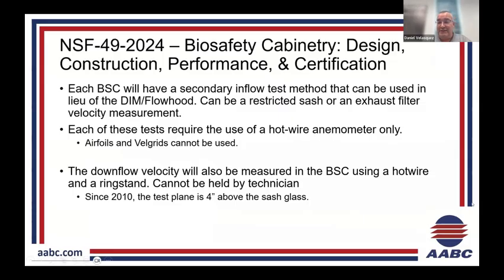Also to note, because when I first got into this trade I thought it was the nuttiest thing to use a flow hood on a bio cabinet, each manufacturer will have a secondary inflow test method that can be used in lieu of the hood. If you can't fit a hood on because you're in a tight space, you have to use a different method of testing the inflow. It could be a restricted sash, or it could be exhaust filter velocity measurements.